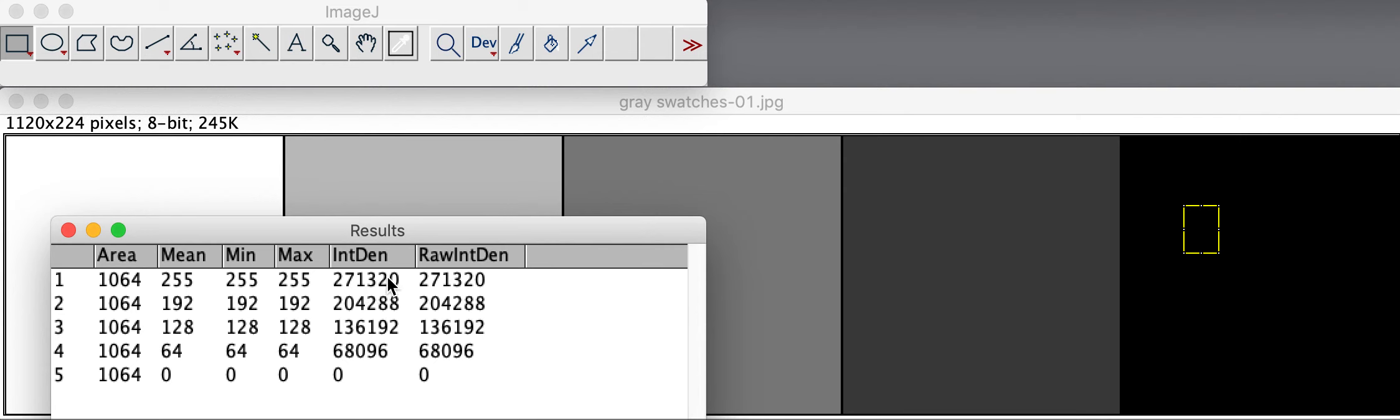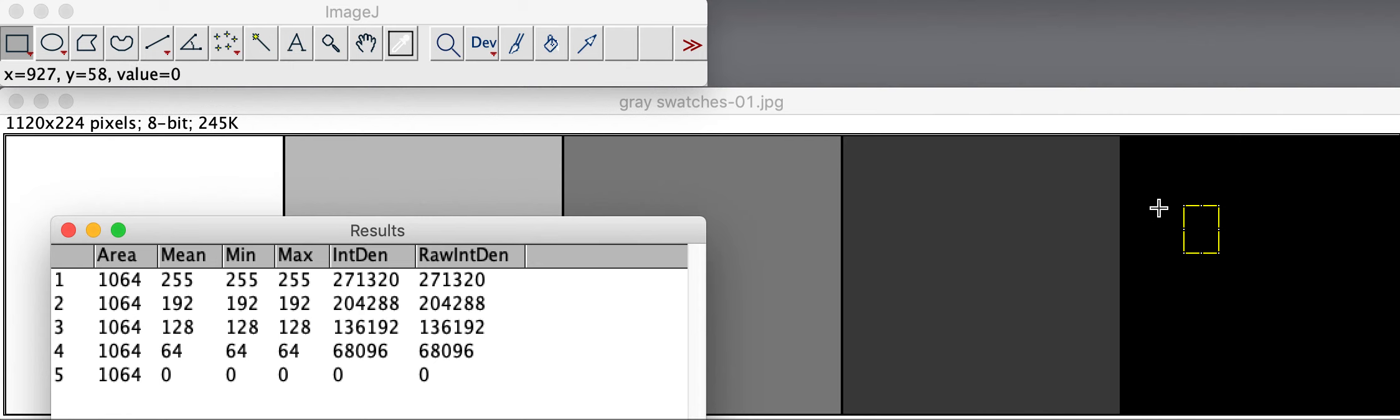So you can use the integrated density values of the measurements taken using ImageJ as a sort of equivalent method for spectrophotometry.